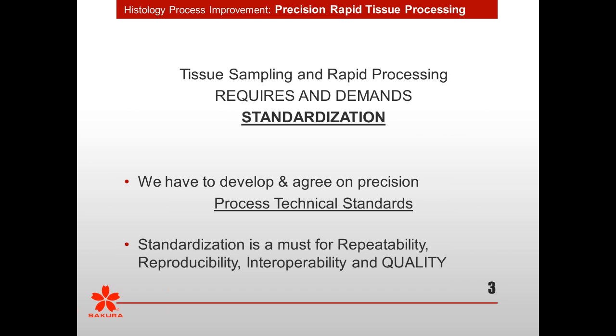Most of you are aware of the difficulties of an H&E stain. We all say we do an H&E stain. As many different labs that are participating today, we probably have that many different H&E stains. We have to get better and reduce the variation. It's a must to have that standardization, because not only do we want to be able to repeat our results in our lab and reproduce them from tech to tech and multiple techs, but we really need to keep pushing for standardization of our processes so we can get that interoperability.